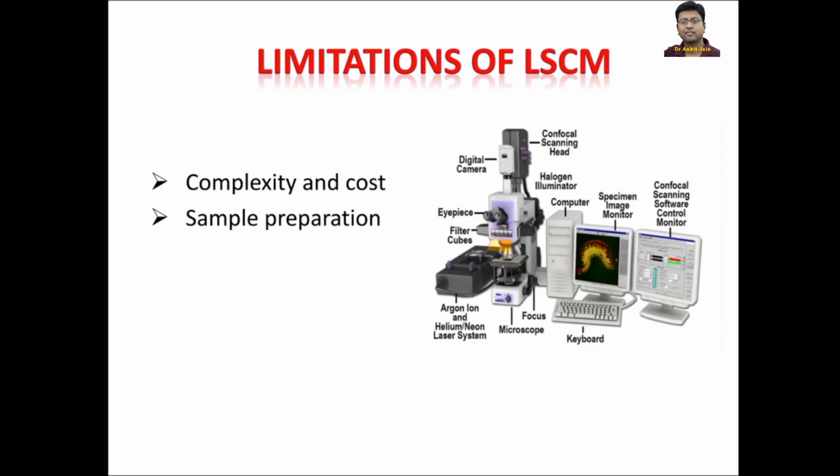Now coming to the limitations of LSCM. It is very complex, the instrument is very expensive, and the sample preparation is very tedious.